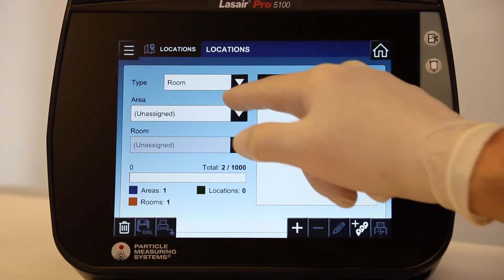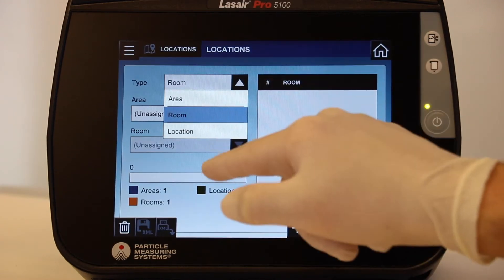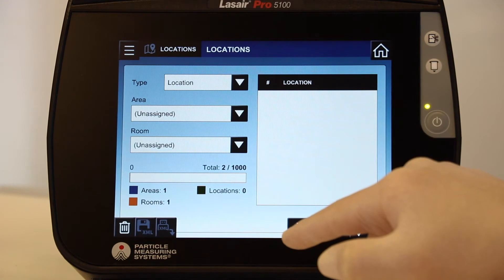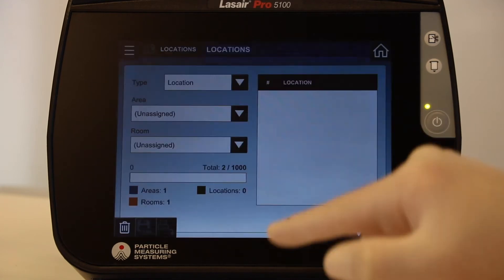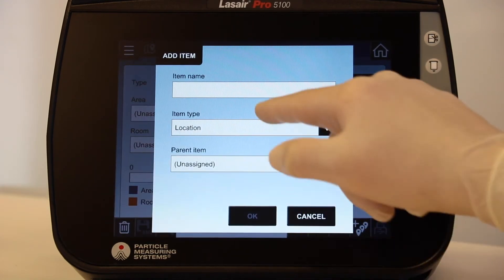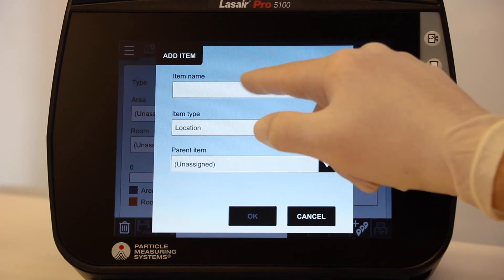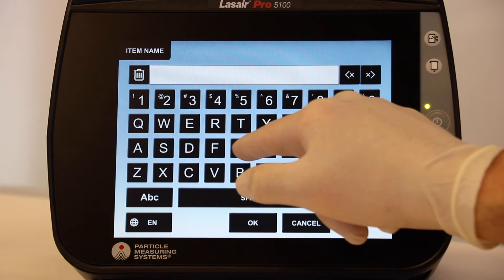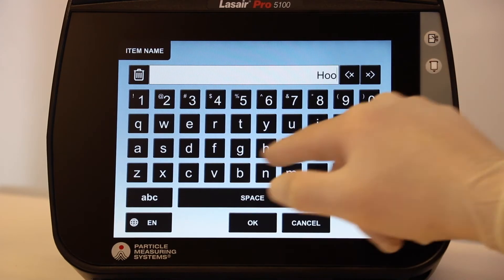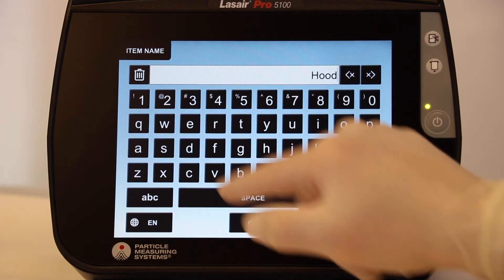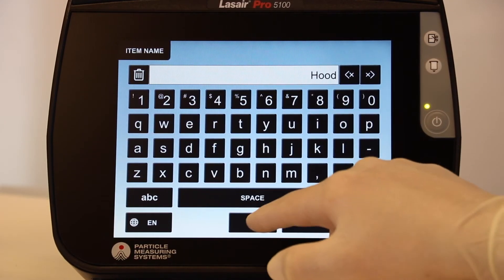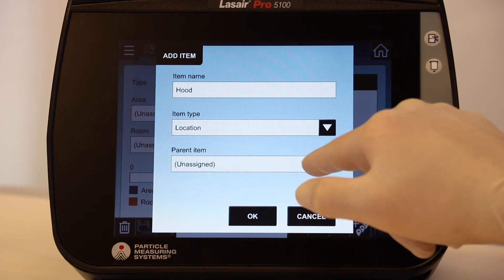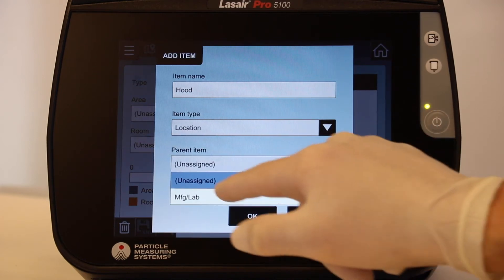Now we will add a location by selecting Location in the Type drop-down, then select the plus button. Enter a name in the Item Name field and select OK. Here you can also assign a parent location — we have chosen the recently set up MFG in the lab room.